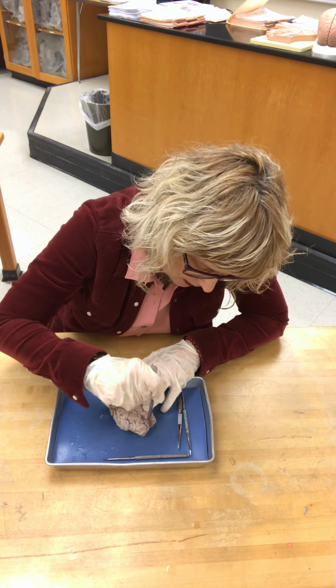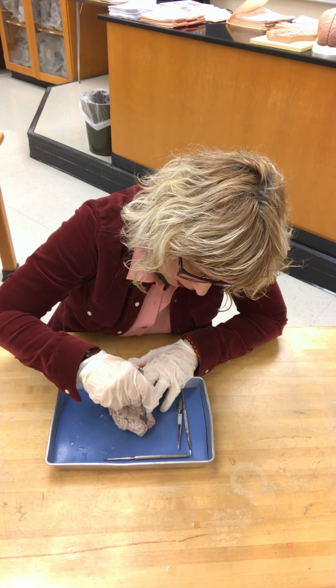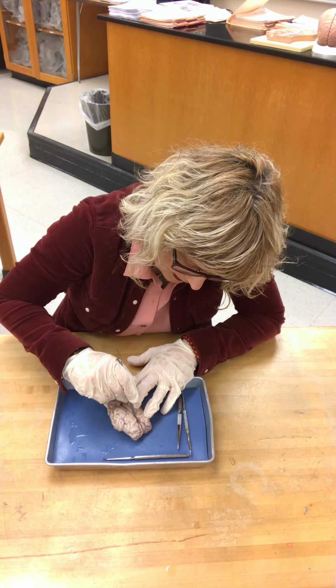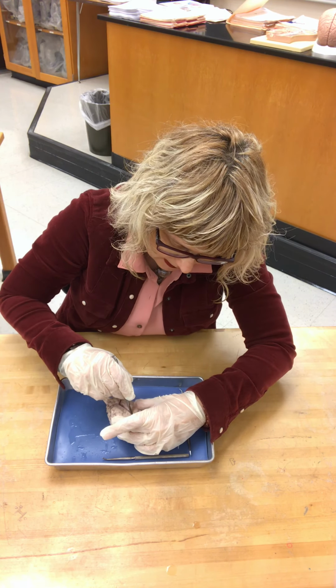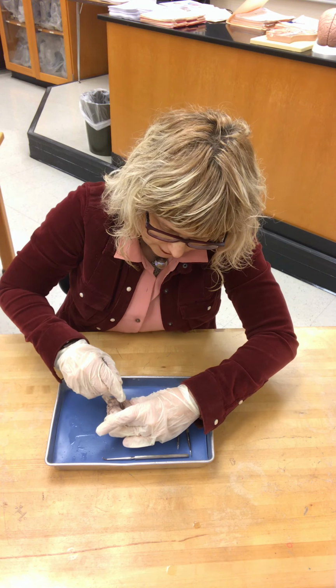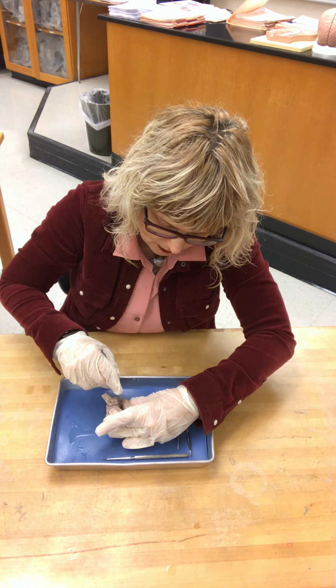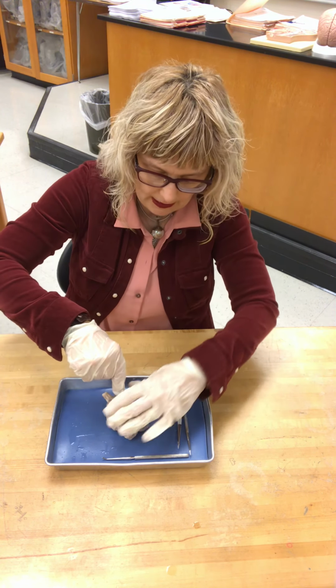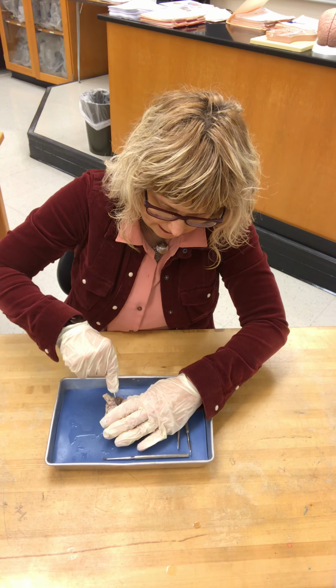Okay, so hold on to the brain, make one nice long cut, and even if the blade is dull, you will feel ease into it and it'll naturally cut. Just don't be violent, just go slow, nice and steady. And then once you get to the cerebellum, continue the same straight line.